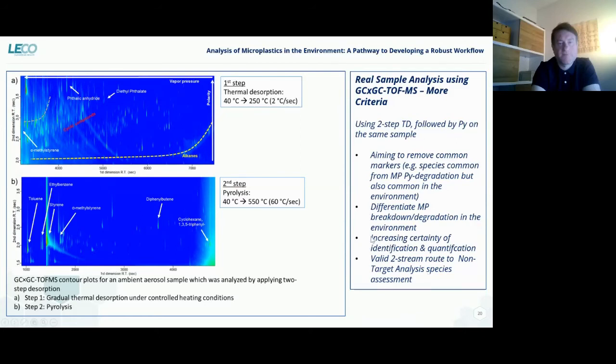And it's a complex situation, of course, because we have to also understand what happens when materials are transported by microplastics. And as microplastics break down in different ways, at what stage do associated materials become what you would see as free volatiles in this method, rather than being retained actually within the microplastic surface structure. So this is all going to be very, very key in terms of the workflow steps, and separated out much, much further in order to gain the insight required moving forward.